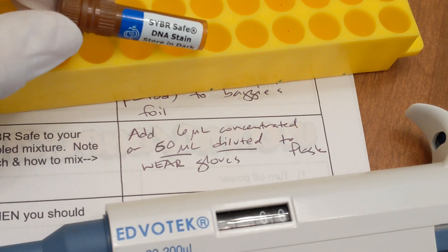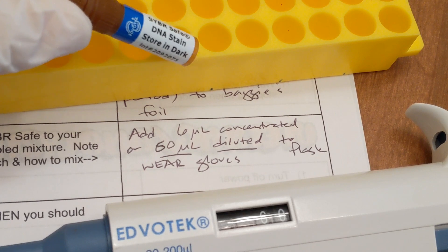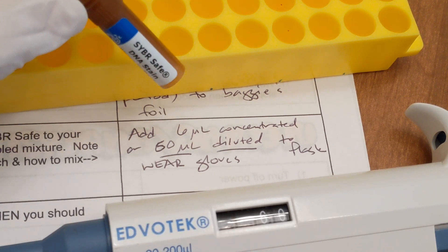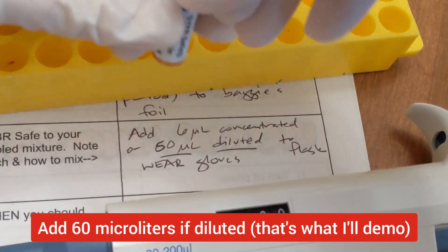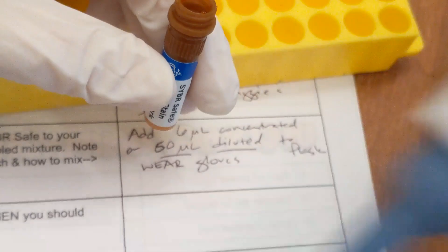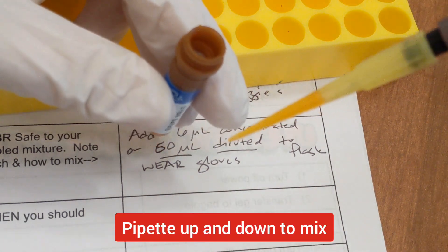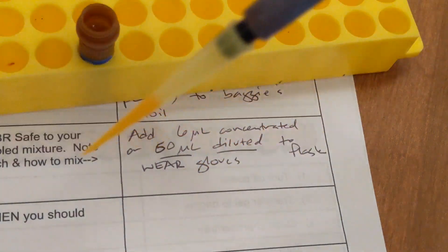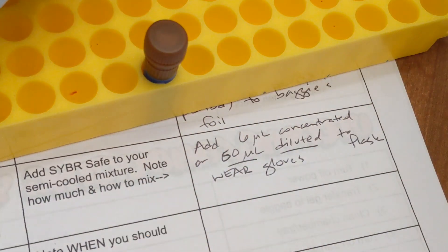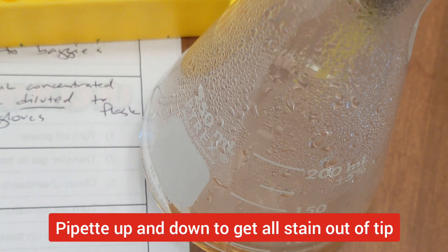Our next step is to add the SYBR Safe, which is what's going to make the DNA visible on our gel. If you're adding straight SYBR Safe, you want six microliters for a 60 milliliter gel. This SYBR Safe has been diluted, so we're going to add 60 microliters. Check with your teacher on whether it's diluted or not so you know how much to add. Set your micropipette to 60 and pipette up and down a little to make sure it's evenly mixed. You should see a slight tint. Make sure to cap the SYBR Safe immediately — it's one of the most expensive reagents we use. Put your tip into the gel and pipette up and down to get every last drop out.